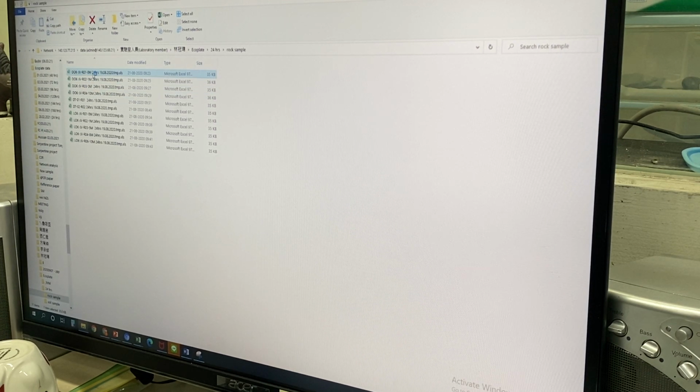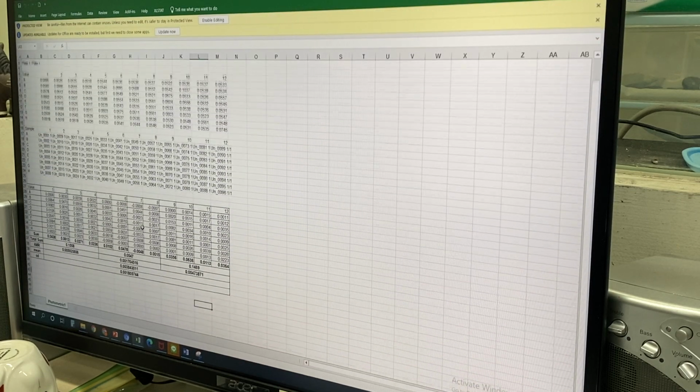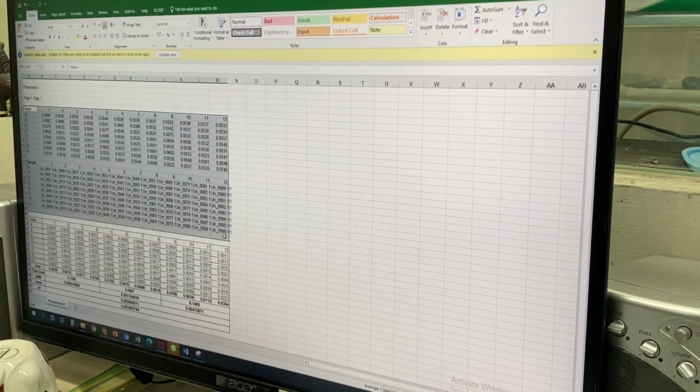this kind of reads, okay. So this is your first read, okay. This is your first read. So how you need to do this one? So you just receive this kind of reads, okay.